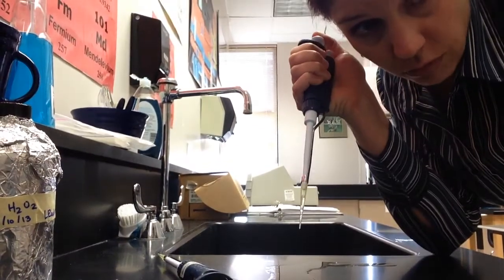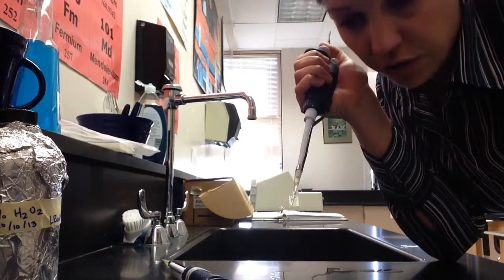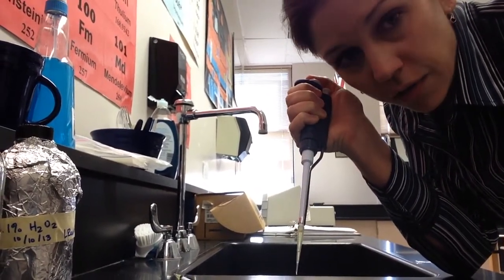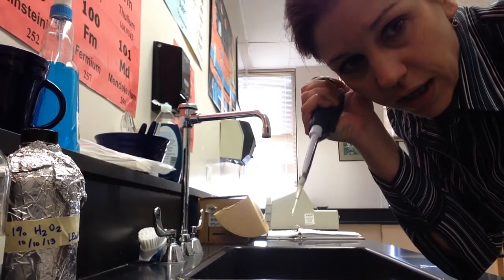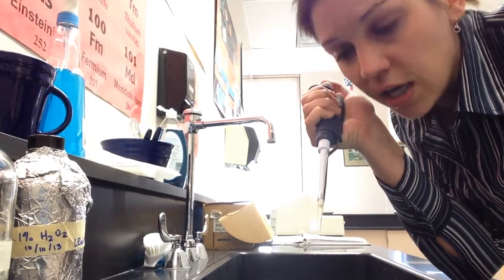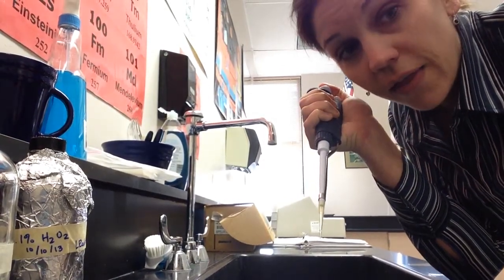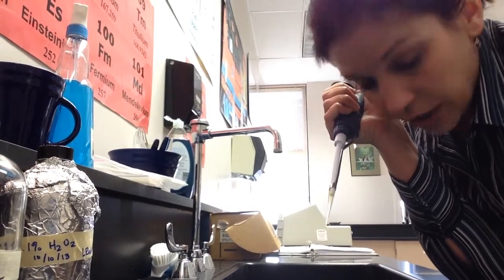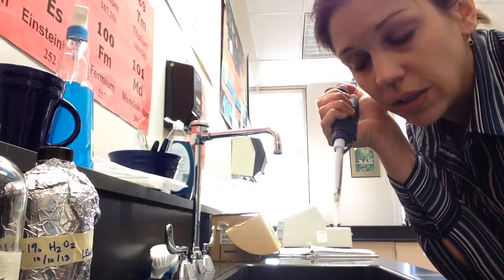Then, once you've got that, you put it over your test tube or whatever, but now instead of depressing just to the first stop, in order to make sure you get any residual liquid out of that tip, you press all the way to the second. You see how more of it came out to the second stop. That way you're sure that you're getting all of your 100 microliters out. So again, if you just need 0.2 mils, you're going to do that twice to get 2 doses. If you need 0.3, you're going to do that 3 times.